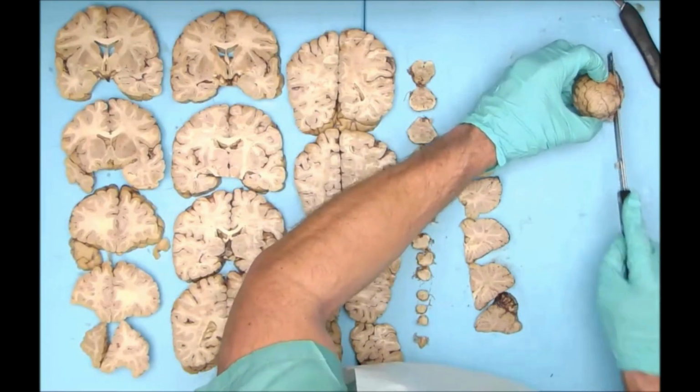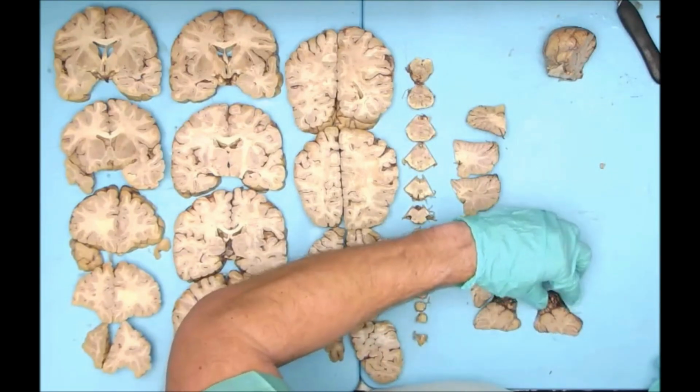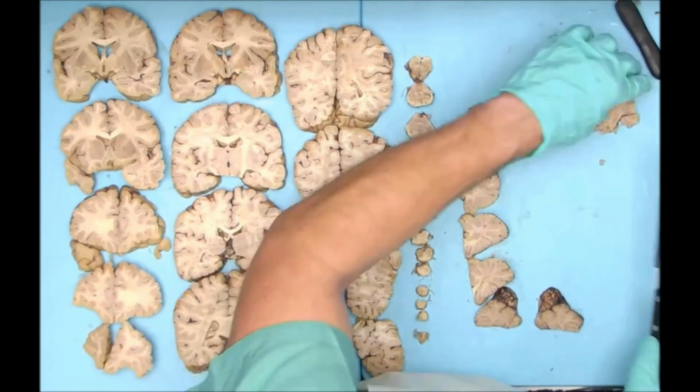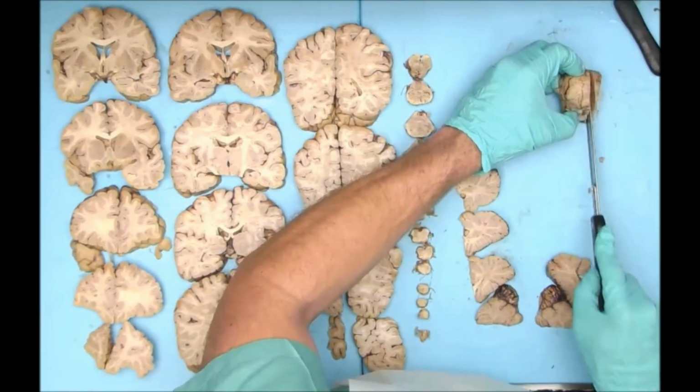Okay, now sectioning the other half. Putting those in sequential fashion.